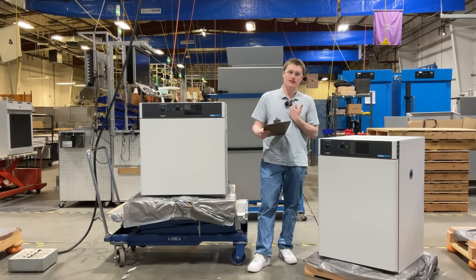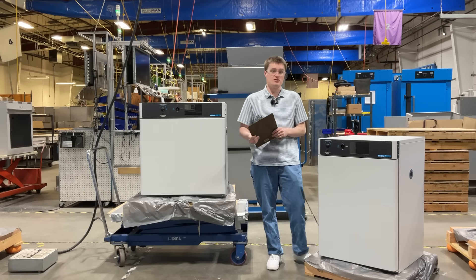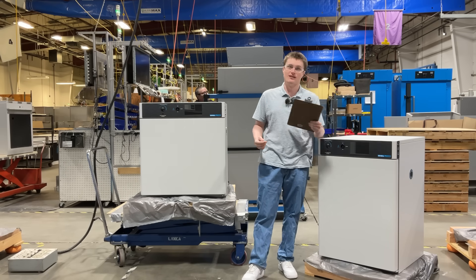Hello again. My name is Kord Seng Snake. I'm a design engineer here at Sheldon Manufacturing. Today, I'm going to be introducing the SMI-6 and SMI-7 microbiological incubators offered by Shell Lab.